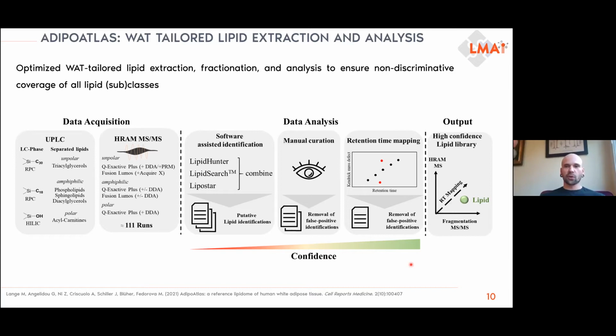This is the workflow summary that you can see here. I will go into detail on each of these parts. But what you can already see is that we couple several different kinds of liquid chromatography to several kinds of high resolution mass spectrometry to really assess the complexity of this lipidome. Then we applied a very rigorous data analysis workflow that was supposed to cover the entire lipidome, and to cover it with very high confidence.